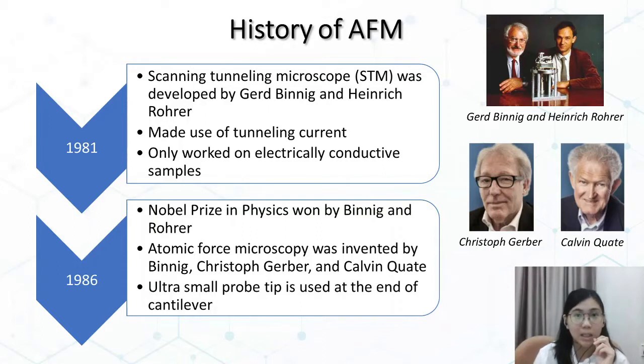Finally, the detection of the cantilever's vertical movement was done with a second tip, which is an STM placed above the cantilever.